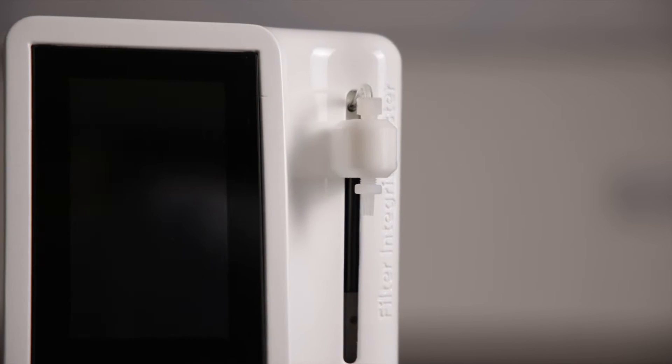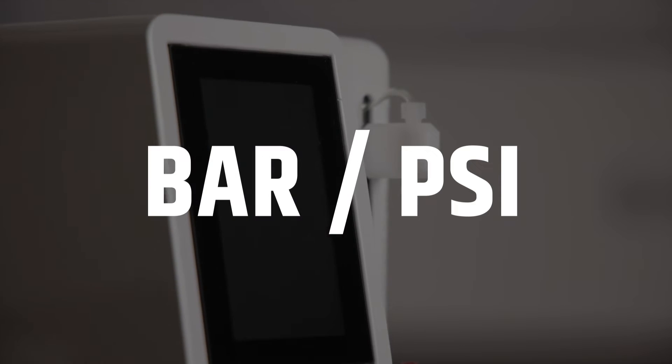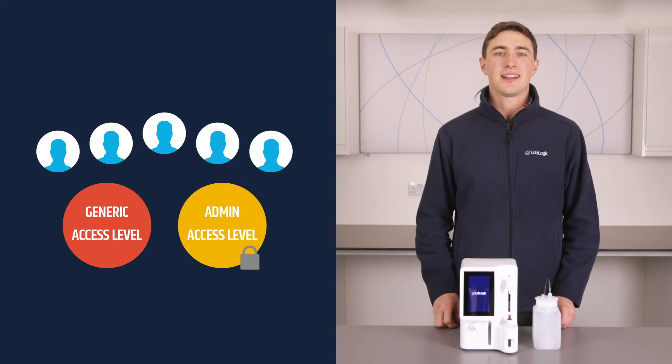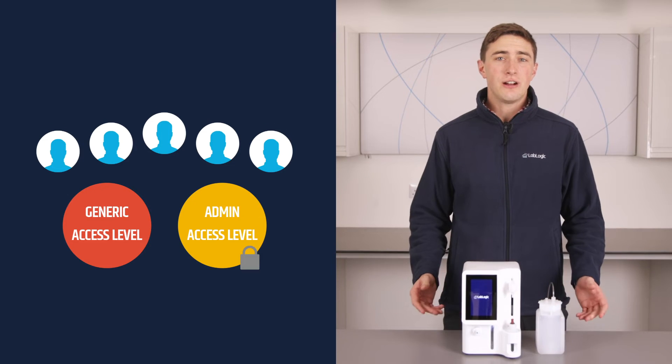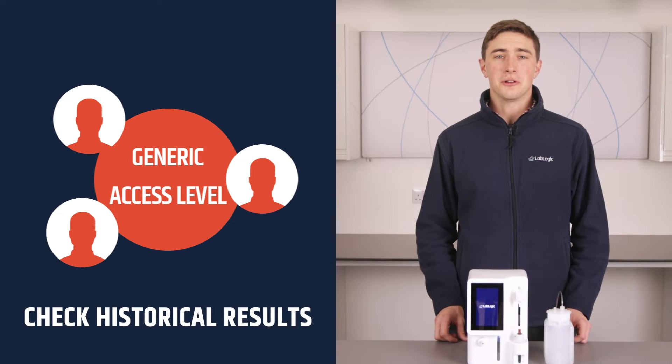The pressure units can be changed between bar or psi depending on which you may use. The unit offers five custom users to set two access levels. The generic user level grants them access to run a test or check the historical results.